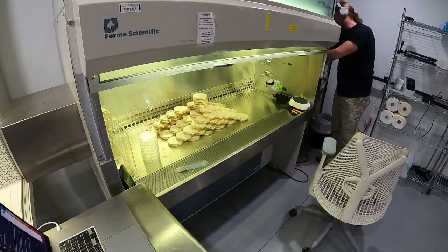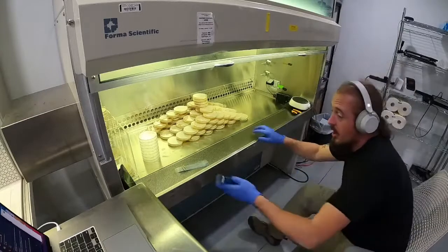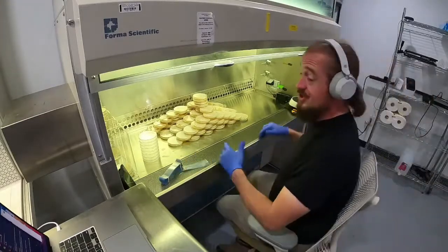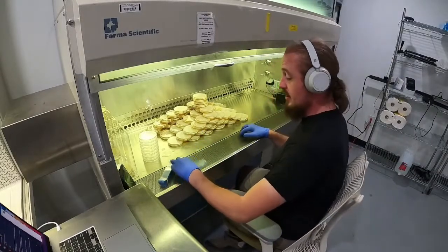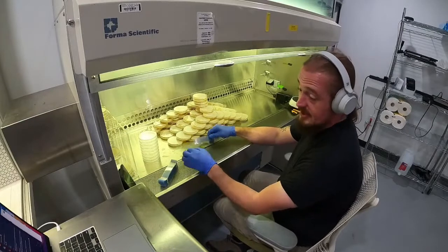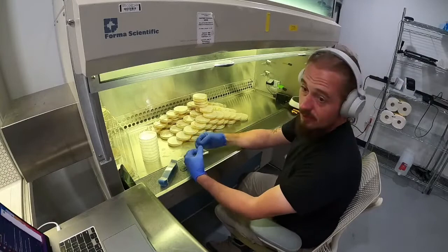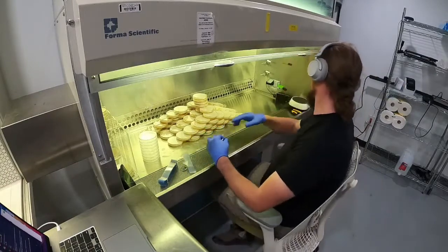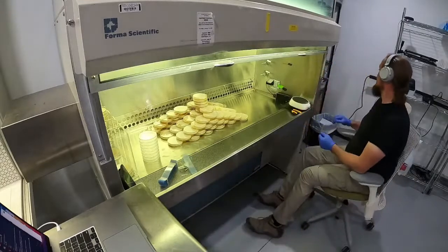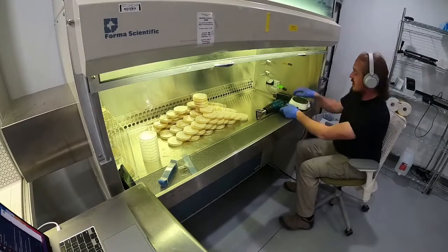We've got a lot of really exciting things that have been happening because more and more, like I was saying earlier, we're getting involved in legalization and other things. And so we've been rolling out more and more genetics from our library. So we've got probably 120 different culinary and medicinal species, followed by another 30 or 40 therapeutic species. So all told, I'm staring down the barrel of having to maintain a 200 plus species culture library, which is vaguely intimidating.